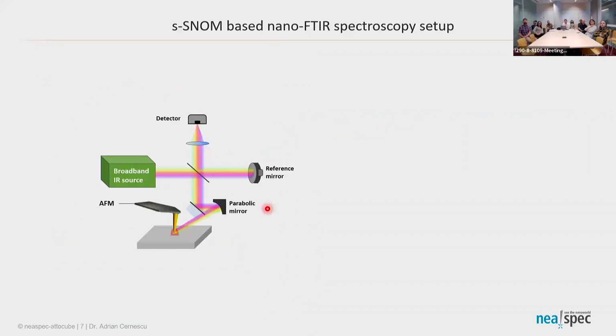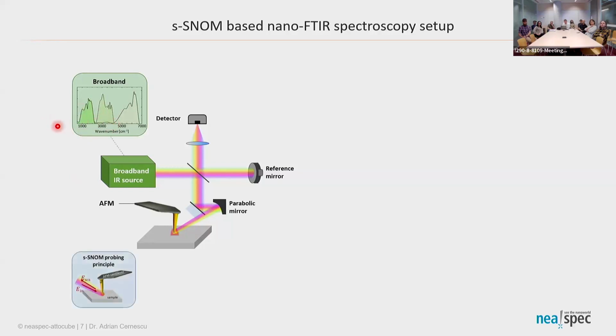This is also about, of course, nano IR, but it's spectroscopy. You can use also broadband lasers, and these are some typical spectral ranges, coverage of the lasers. It's possible also to use synchrotron infrared radiation for this measurement. So it's the same working principle.